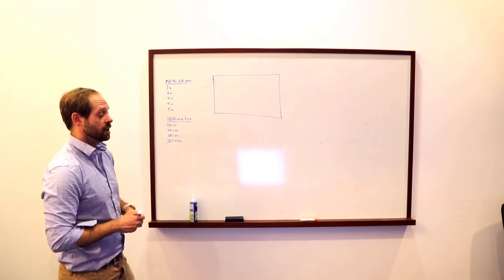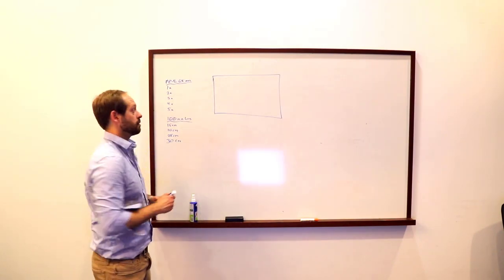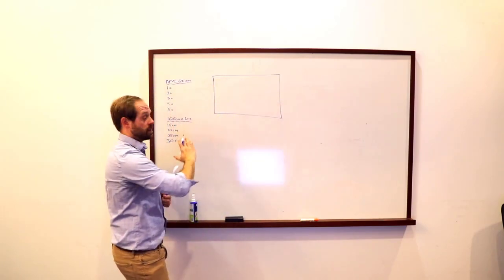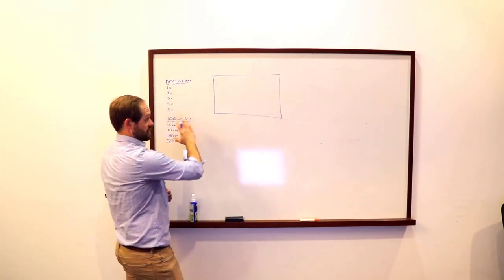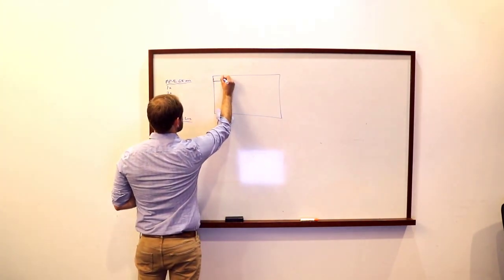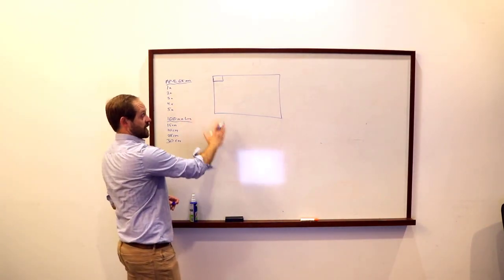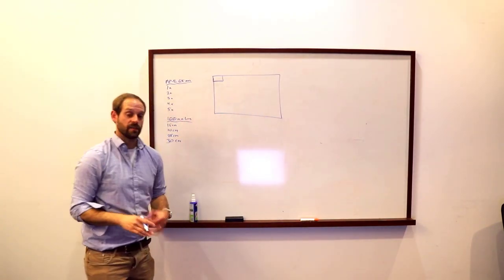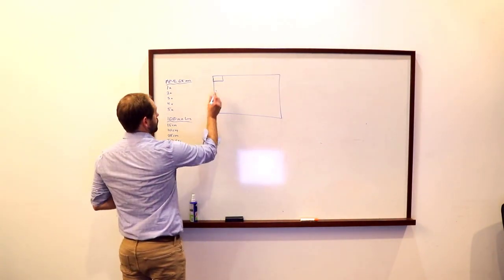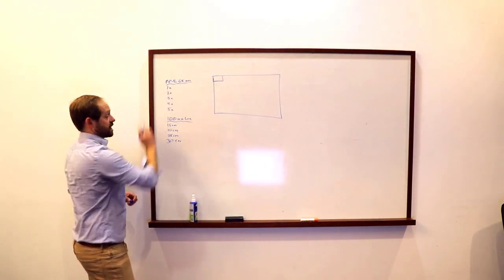So what is field of view? Field of view is the total amount of area that the camera is seeing. If this is my entire insect tray, insect box, or soil box, the camera might only see that much of the total area. Remember, we're focus stacking and producing a panoramic to produce a very high quality image. So let's say this field of view corresponds to the magnification at 1x.